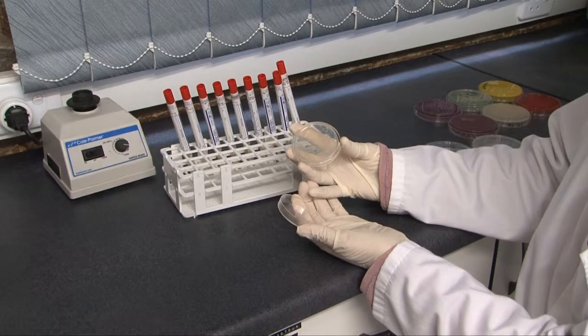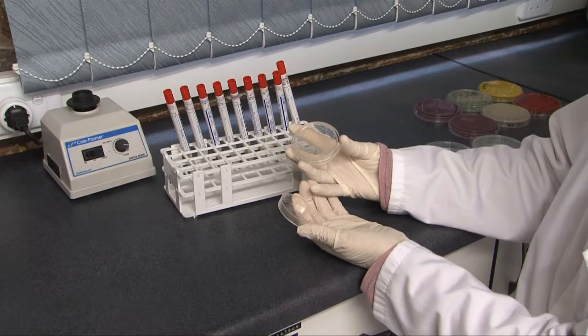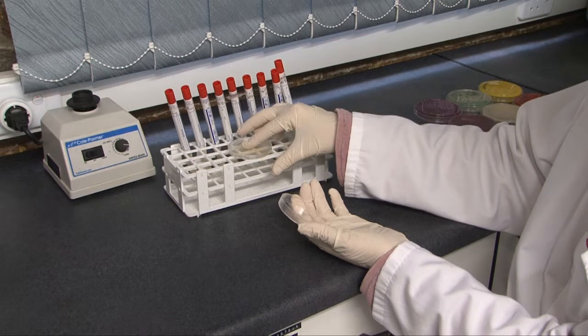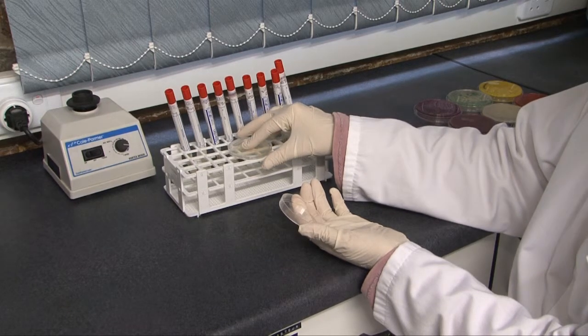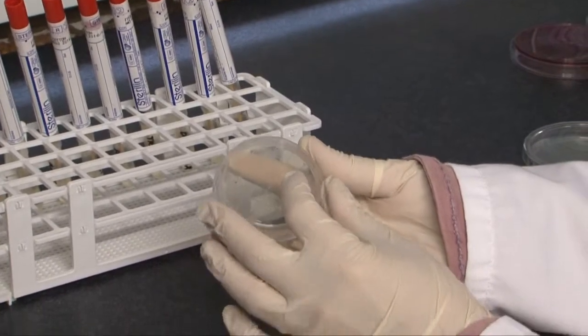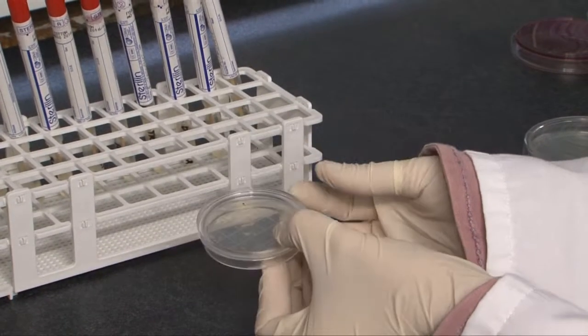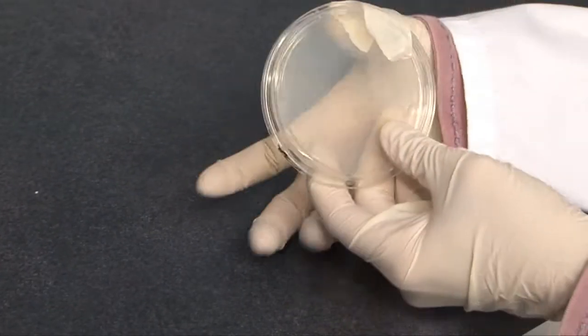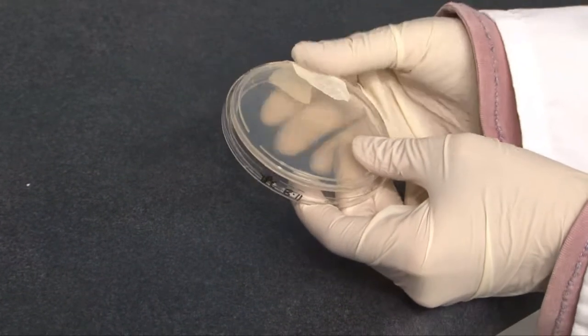Check to ensure the agar bulges above the sides of the plate before proceeding with sampling. Place the Rodac plate, agar side down, on the surface you wish to sample and apply gentle pressure to ensure the entire surface area of the agar comes into contact with the surface being sampled. Replace the lid on the Rodac plate, again holding the Rodac plate by the circumference of the base. Bind the lid of the Rodac plate to the base with masking tape to keep it sealed.